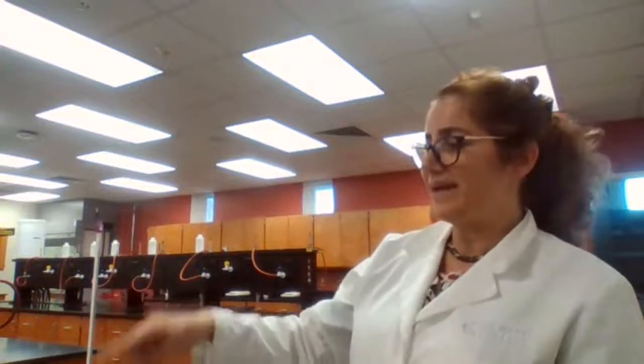I say close because if there is any error on the thermometer, if the thermometer is not calibrated, you may not get the exact same number. But if the thermometer is calibrated and my sample is pure, we should get the exact same number as the literature value. So we can identify the compound using melting point, or we can determine if the sample is pure or not.